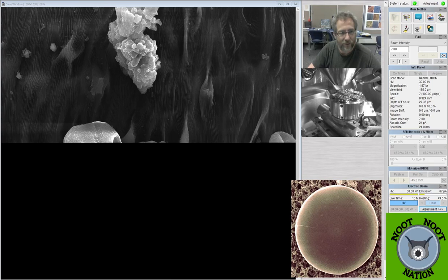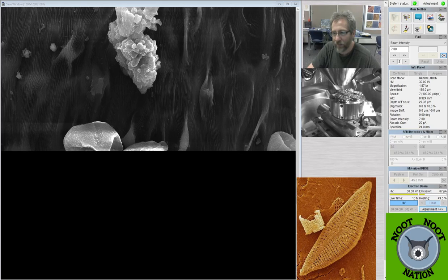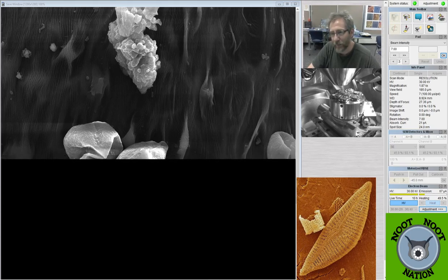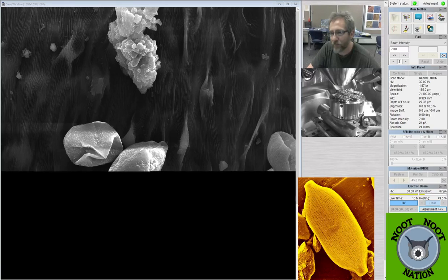You can see it's sort of charging a little bit in here, probably because it's got some moisture. Orange's Onion says maple should be pretty close to redbud pollen. Yeah, I don't know. It doesn't look exactly the same. Maybe those aren't actually the maple pollen, but I think they are. Oh, they're pretty deformed. Okay.